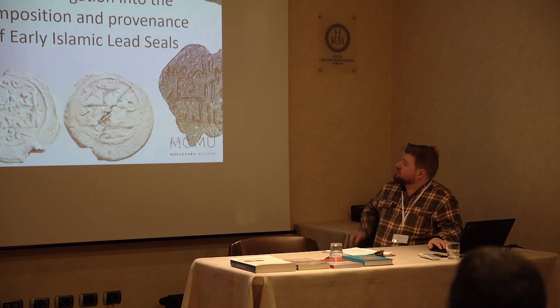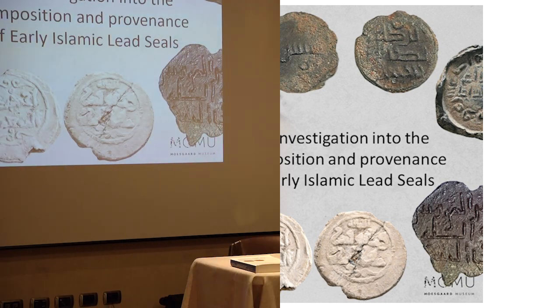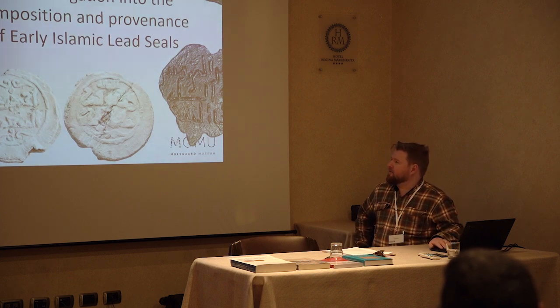These are our newest results. Again, provenancing lead using lead isotopes, which sounds straightforward. And my hypothesis was this is easy because lead's abundant, lead's everywhere. You get some old lead pipe or lead sheet and it should be homogeneous in terms of its signal. We're actually entering a discussion on lead mixing now, which I hadn't really anticipated.